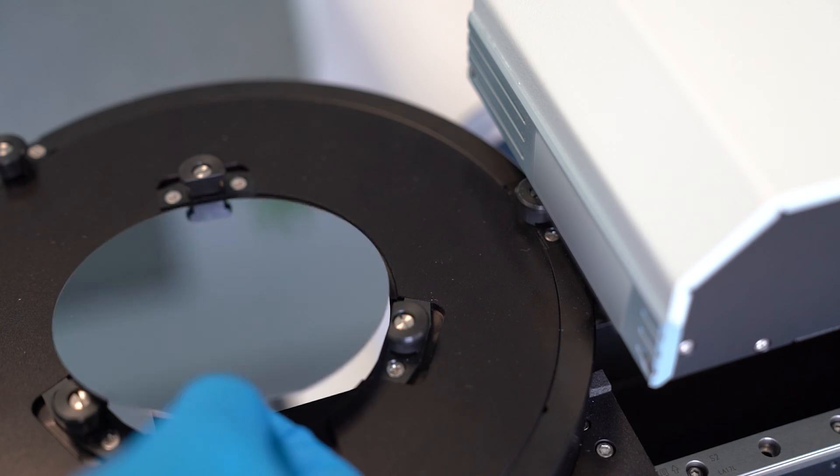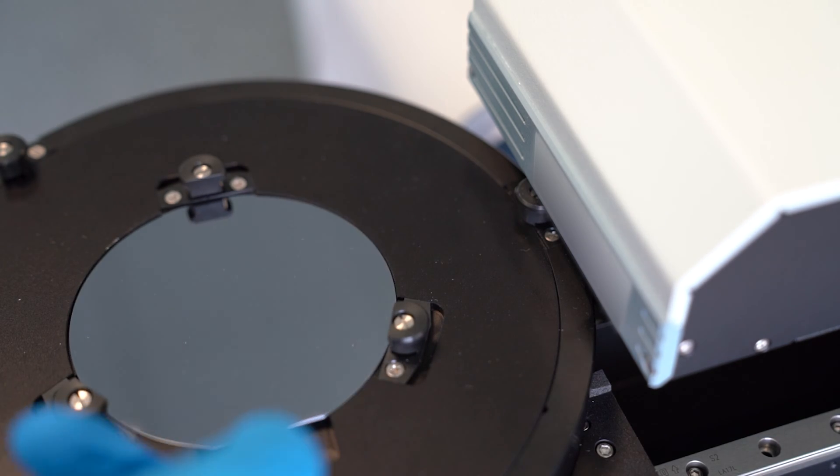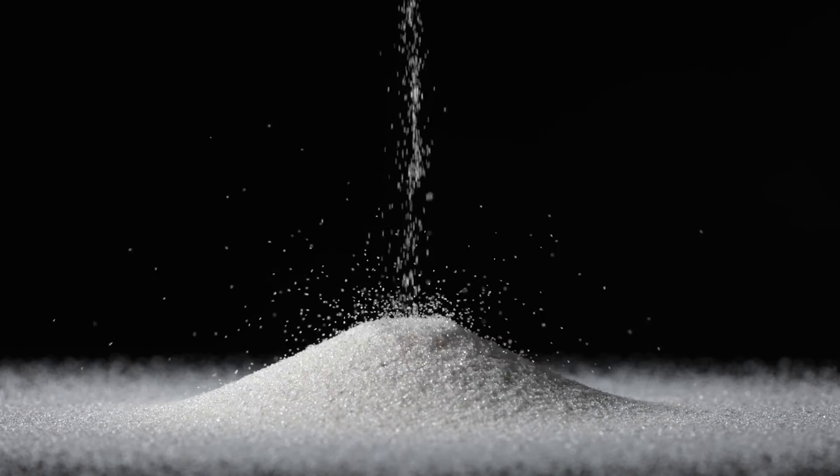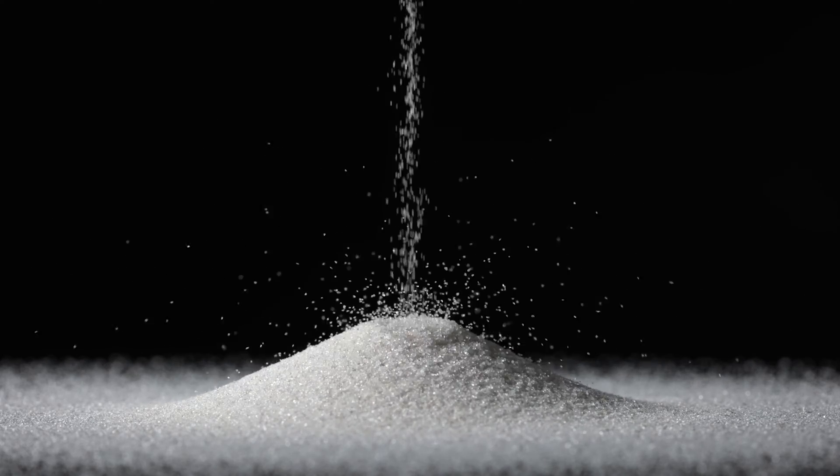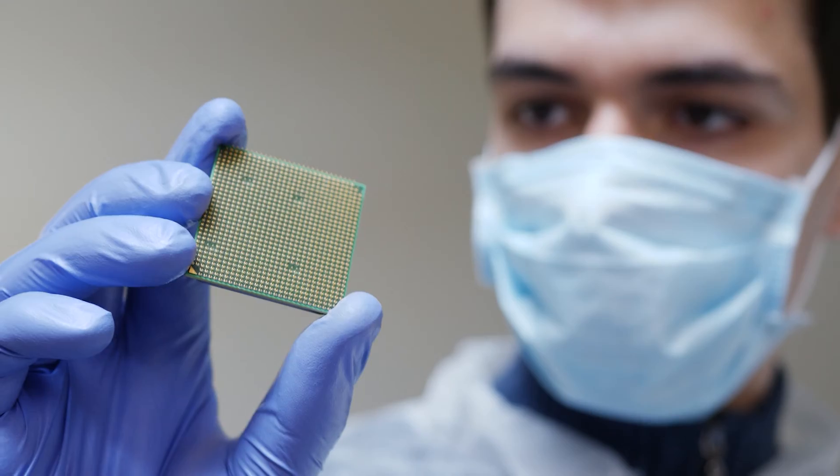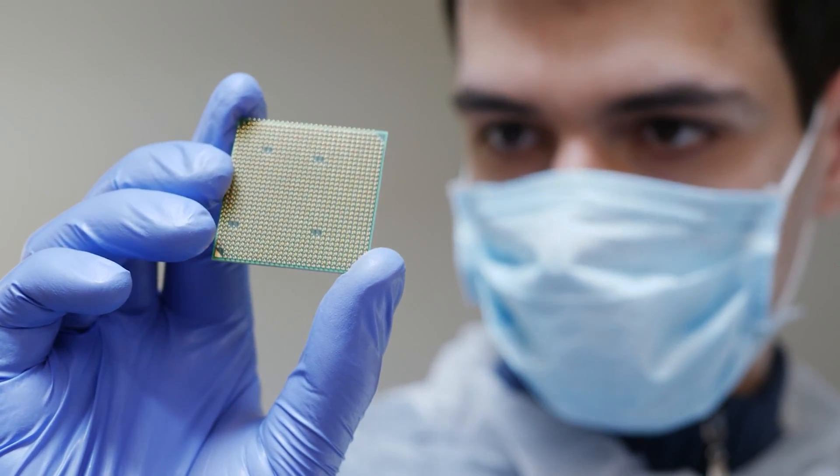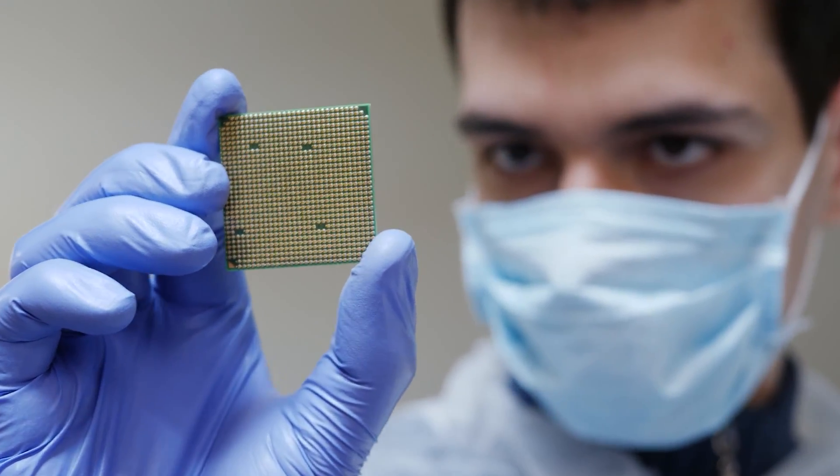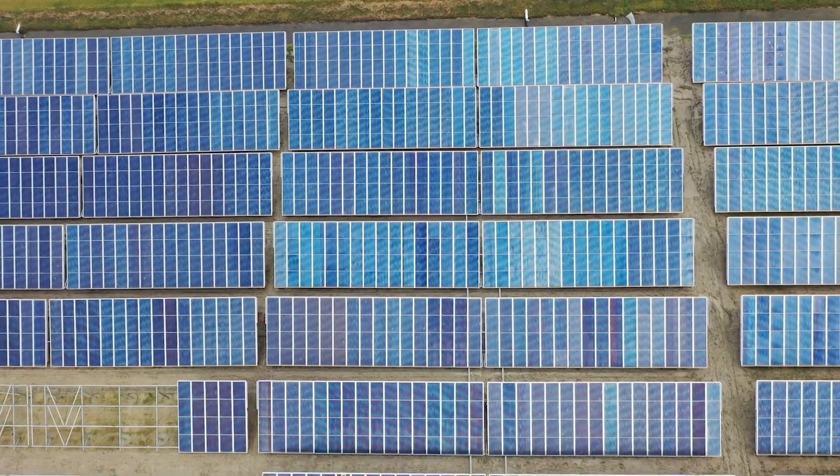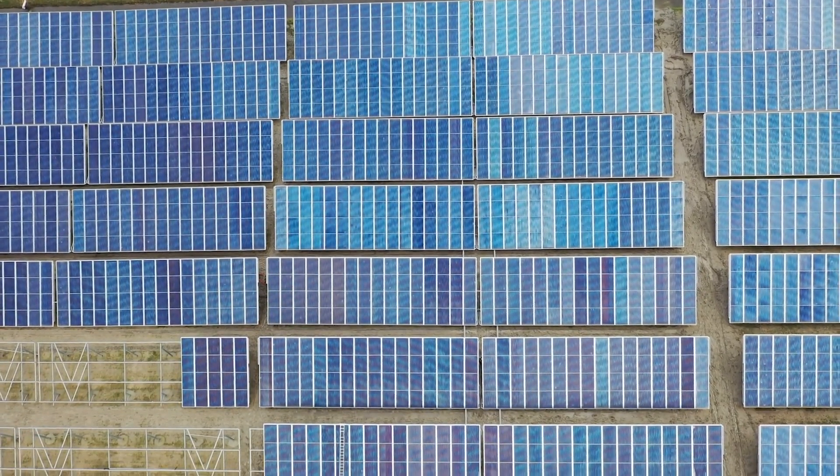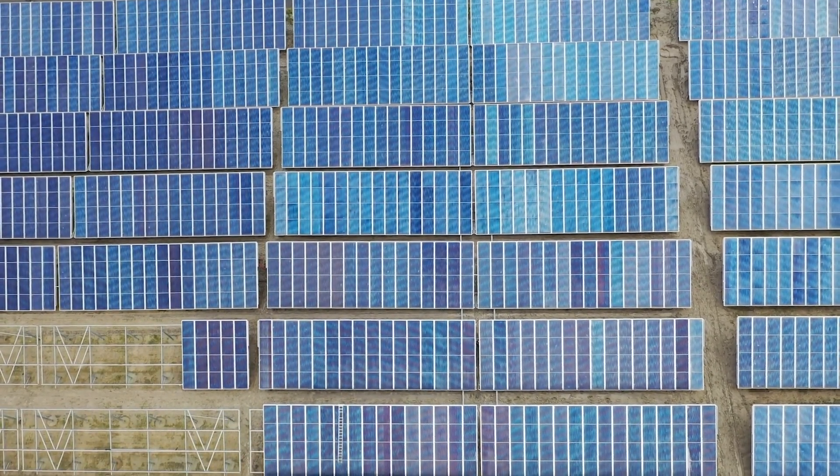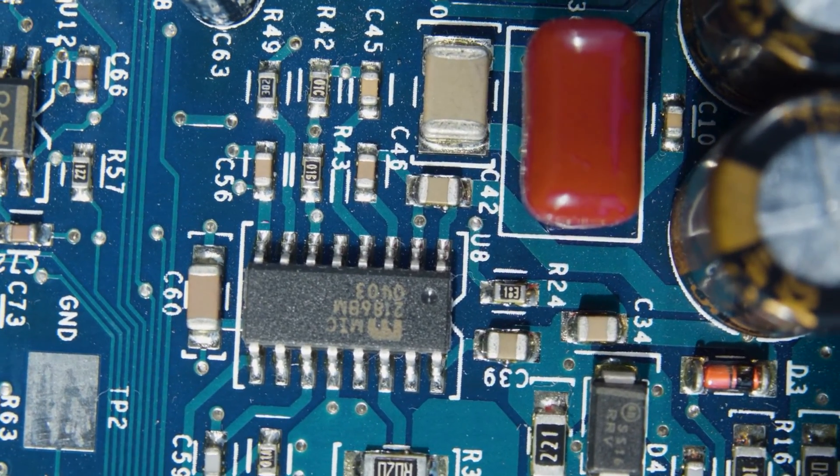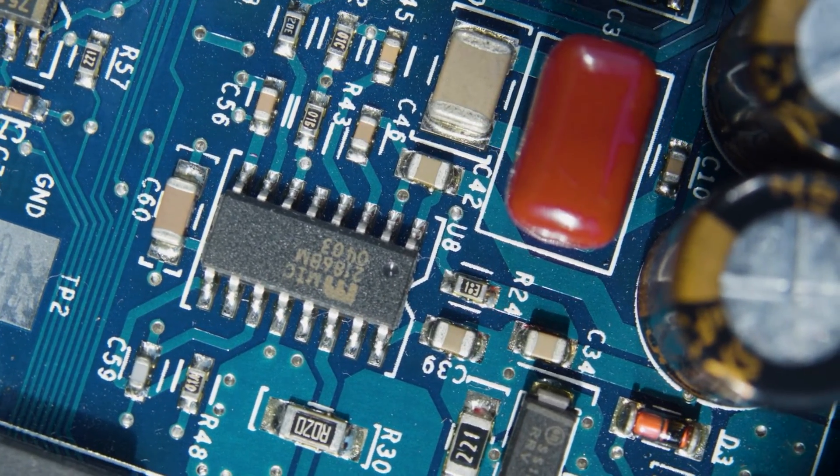This is a silicon wafer that's undergoing quality control. The silicon in these wafers comes from sand, and as the sand is processed there are a number of quality control steps. These QC steps are important since we need high quality silicon to make things like solar cells and the chips found in nearly every electronic device like your smartphone.